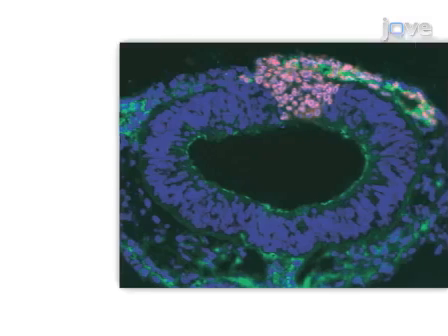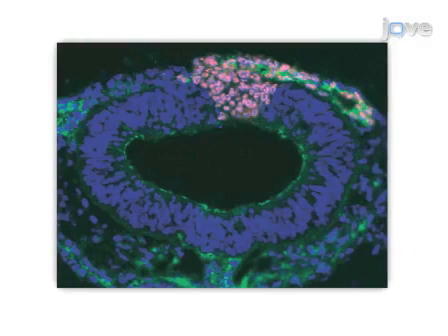choice. Ultimately, the migration and differentiation of donor-derived neural crest cells to various locations in the host embryo can be visualized through immunofluorescence microscopy. Visual demonstration of this method is critical because the microdissection and grafting steps require very fine motor skills, making them difficult to learn.